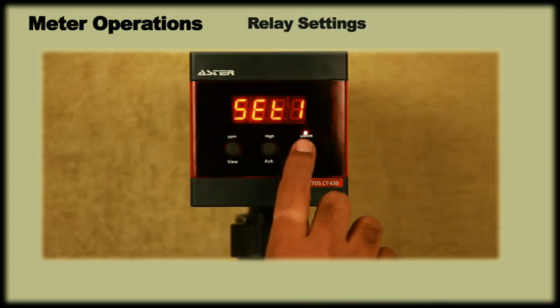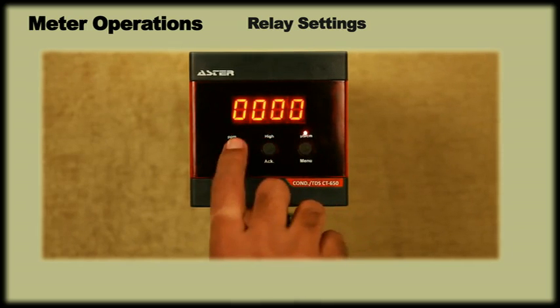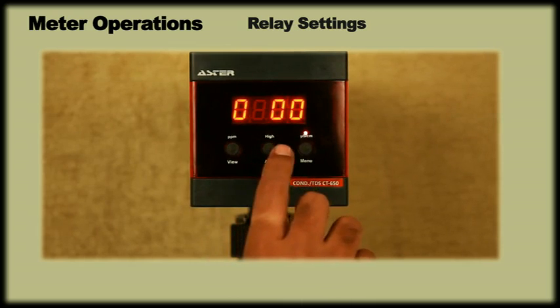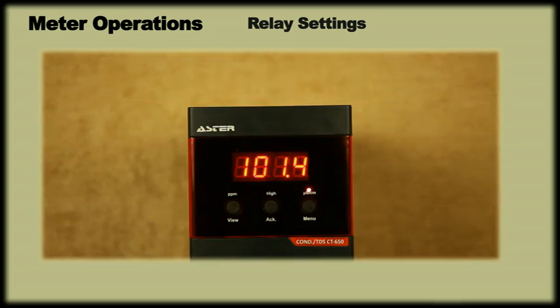The display shows set point. Here we must enter the TDS or conductivity set point of the plant. Using view and ACK keys, enter the value and press menu to save. Please note, if the conductivity goes above this set point value, the meter will send out an alarm with a beep sound and the high LED light will start blinking. In such cases, you can use the ACK key to acknowledge.